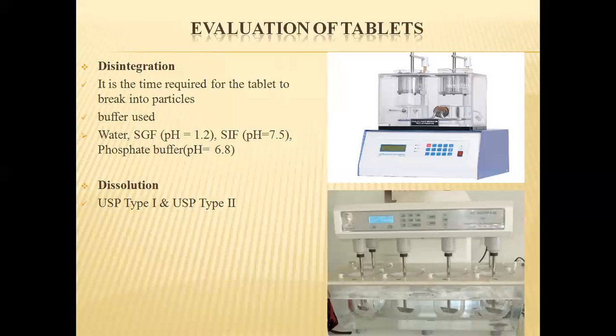In case any of the tablets fails to disintegrate, we have to repeat the test by taking another 6 tablets, replacing the water with 0.1 normal HCl solution. The tablet then passes the test if all the 6 tablets have disintegrated in the acidic medium. The test is repeated by taking 12 additional tablets if one or two tablets still fail to disintegrate. The sample passes the test if not less than 16 of the 18 tablets tested are disintegrated.